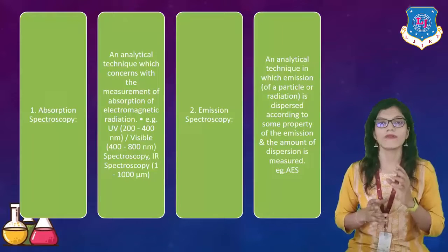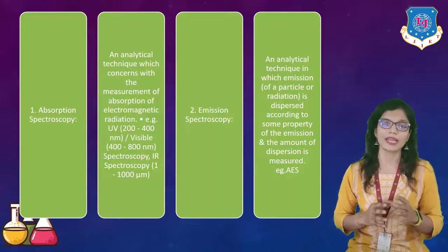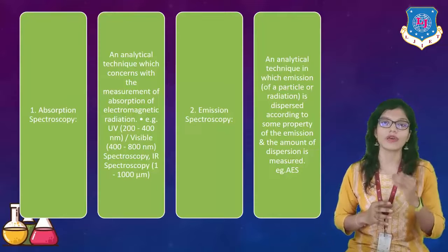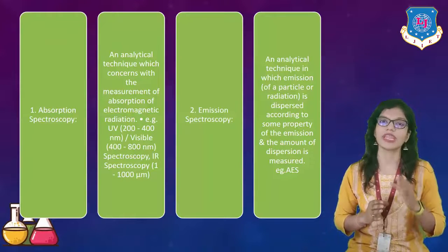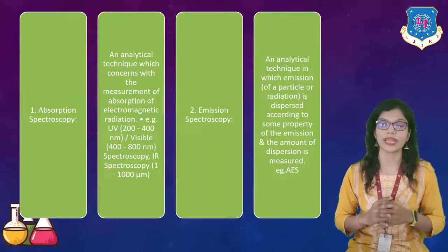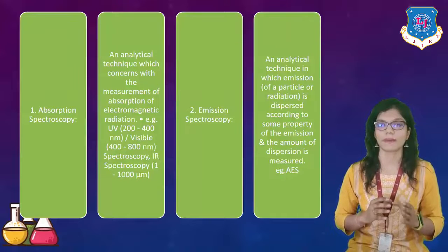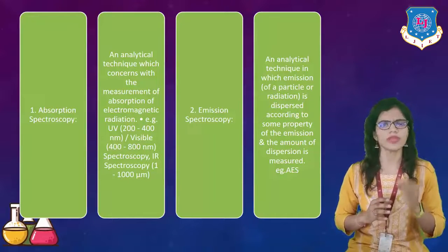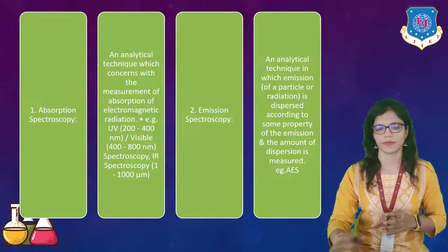Right? This is again a very basic atomic spectroscopy which can detect any kind of metal, any kind of non-metal, any kind of heavy metal also. And these spectroscopies are very beneficial for us as they can determine the samples at a very low level. Even at nano level, they can detect the particular sample. If your instrument is an advanced and updated instrument, then you can analyze your sample at nano level also. A very minute amount, a very minute size, can get precisely detected using these two spectroscopic methods.